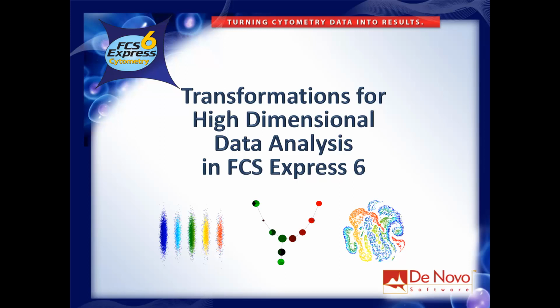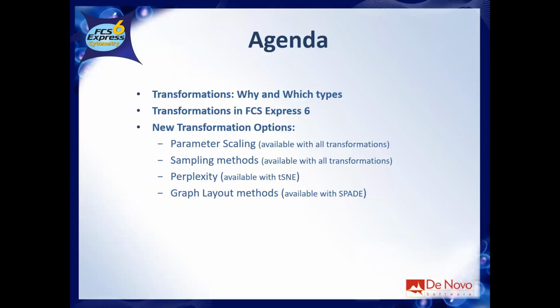Welcome to this webinar on transformation for high-dimensional data analysis in FCS Express. This is the agenda, so the general structure of what I'm going to be doing in the next hour.